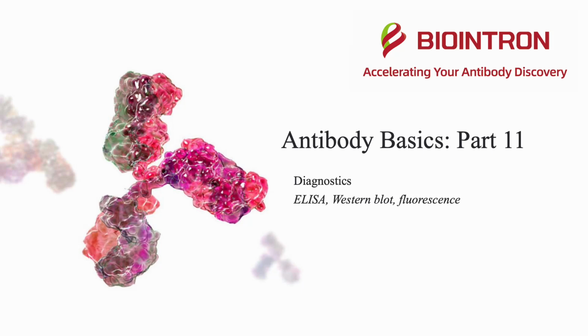Welcome back to Antibody Basics by Biointron, Part 11. In this episode, we'll talk about diagnostics such as ELISA, Western blot, and immunofluorescence.